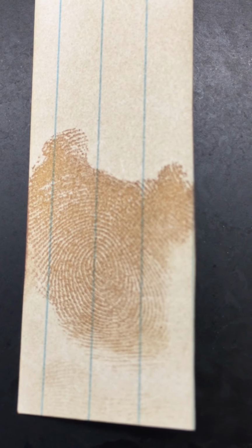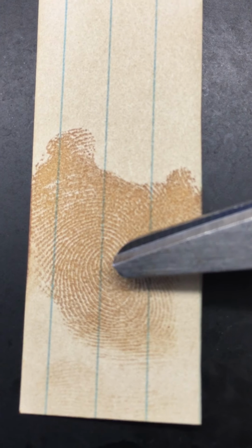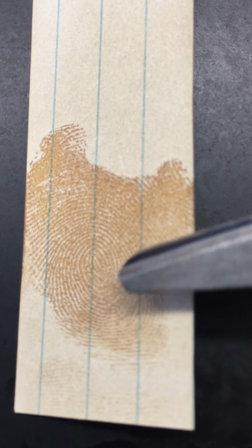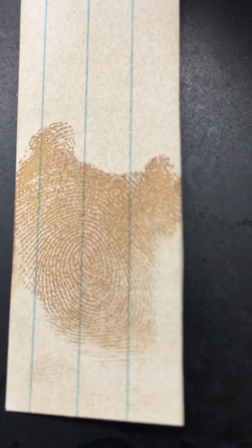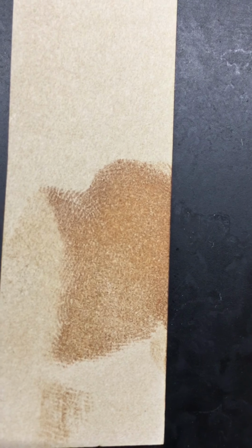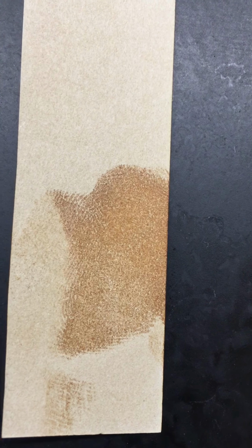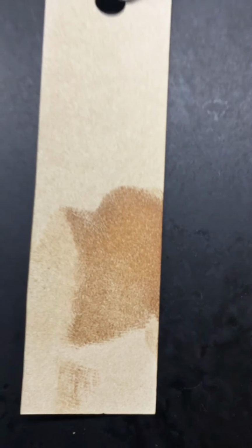I will point it out using the size of the scissors here. This is a whorl. You can see that there's a center, and then there are concentric rings that go around it. Okay, that was my right index. Let's see if it's different for the other finger, my left index. Let's see here, come on. This one did not come out as well, but I think it's also a whorl.